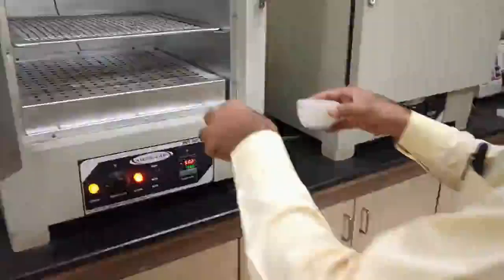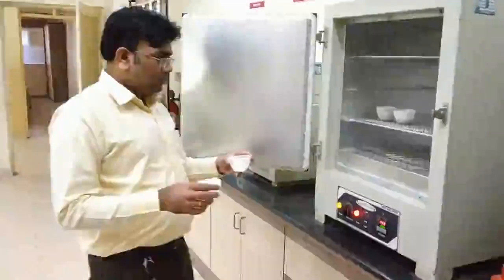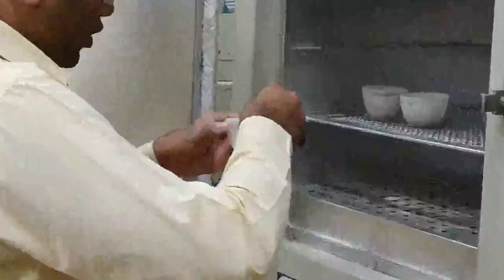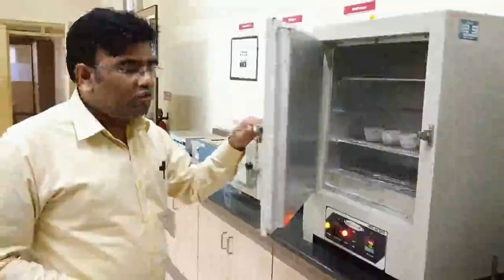Crucibles A and B are for the total solids experimentation, and crucibles C and D are for the total dissolved solids experiment. So all these 4 crucibles we have to keep in this hot air oven till all the water gets evaporated. Normally it requires 24 hours.